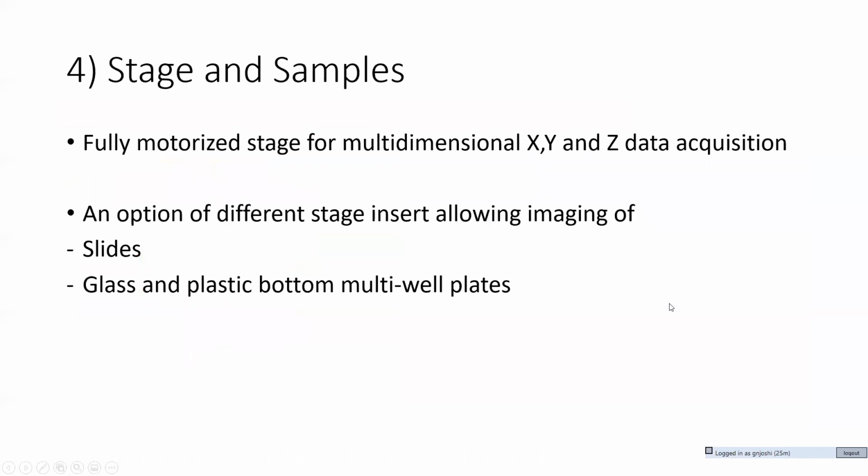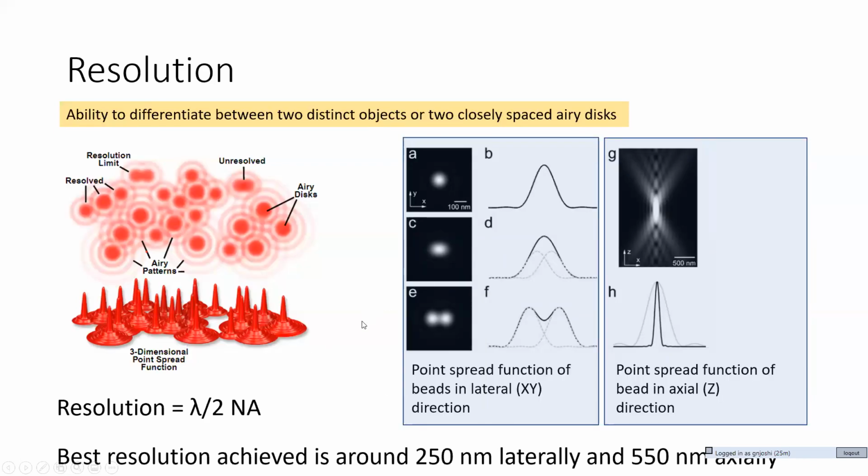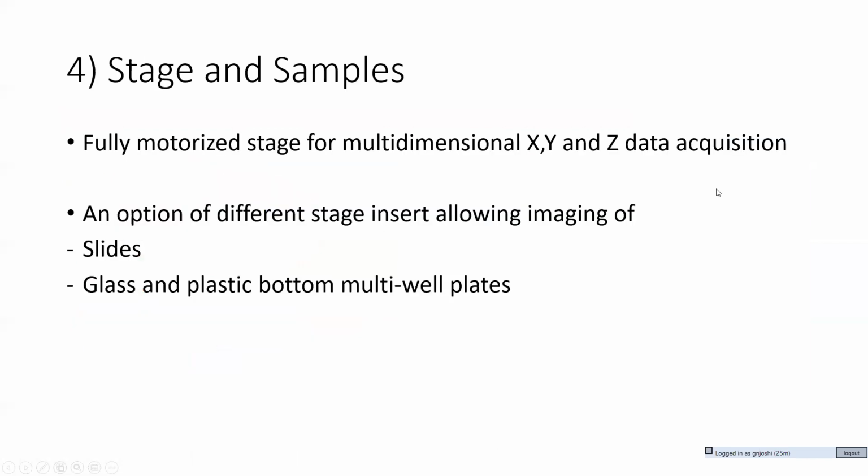All right. So these kinds of concepts become important when you want to do Z sectioning and Z imaging, right? This is not a confocal, but we do have the ability to do Z imaging, and I'll talk about that a bit later.